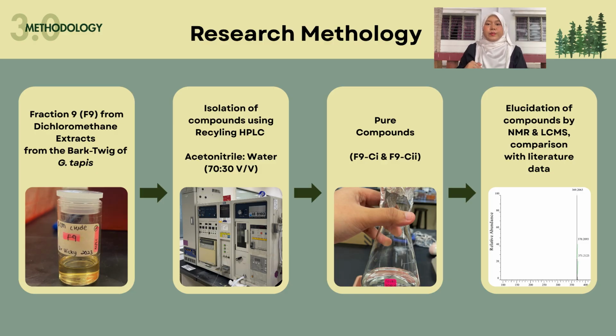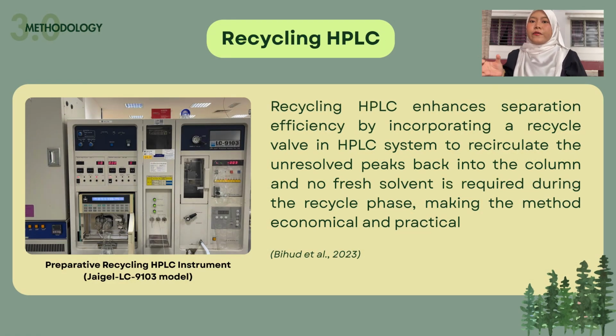And finally, the pure isolated compounds will be elucidated by using NMR and also LCMS spectroscopies. So, the main instrument that I have used and utilized for my study is recycling HPLC because this instrument enhances the separation efficiency by incorporating the recycle valve in the HPLC system, which allows the overlapping peaks of the compound to recycle back into the column, which proves that this method is economical, practical, and also sustainable.